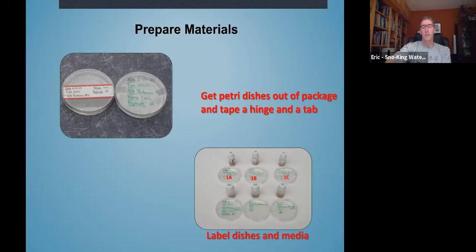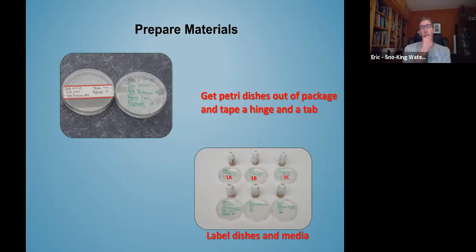And you can see that there shows 3 different samples. So for each site that we're going to sample, we're going to collect 3 what we call replicates. So 3 different samples, and then those get averaged to come up with your number. So we'll label them to make sure that we're not accidentally putting our 2 samples in the same dish. So we're going to have, for instance, 3 Petri dishes and 3 samples that correspond with that.